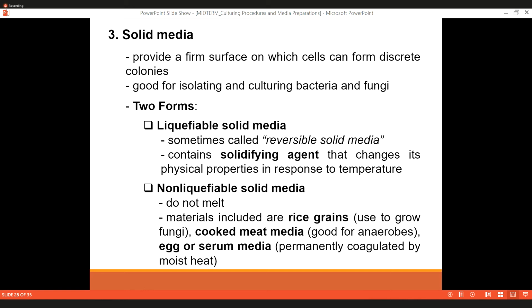Meron kasi tayong media class na hindi siya synthetic. So mamaya may encounter natin si synthetic. Synthetic means na chemically produced siya ba, no? Or naka-powder na siya class, no? So, mas easier si synthetic kasi naka-powder na siya. All you have to do is to prepare, no? Pero meron din type of media class na para talaga siyang pinakbet class na ikaw talaga mag-prepare to come up a media. So, mas kapoy.